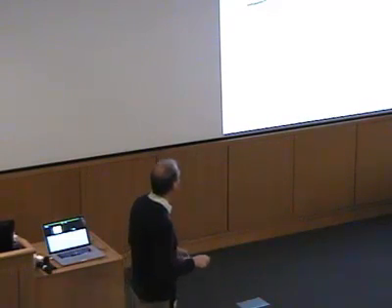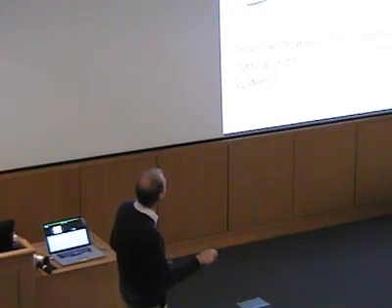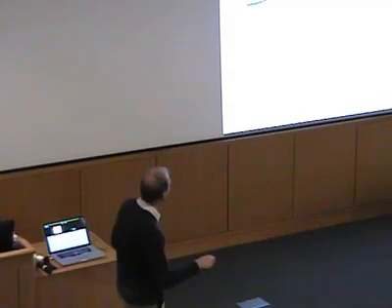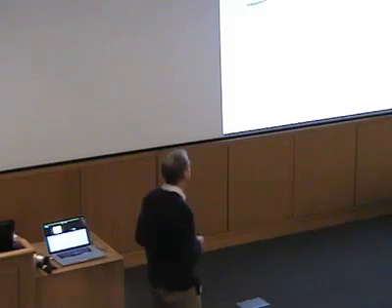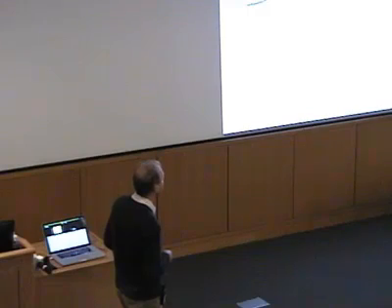go down. And so if our 5.4 G value is coming from this transition and the 4.4 from here, it means that our plus minus 3/2 levels must be lower in energy than the plus minus 1/2. And that gives us then the sign of the zero field splitting parameter.